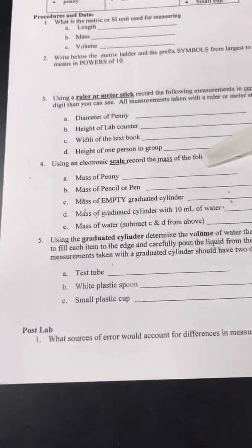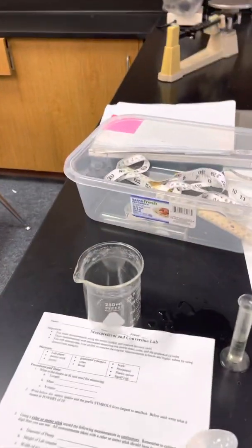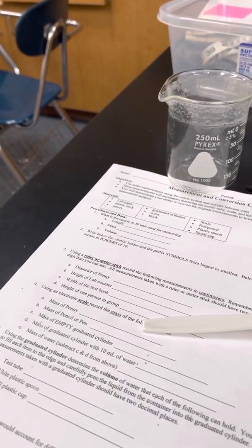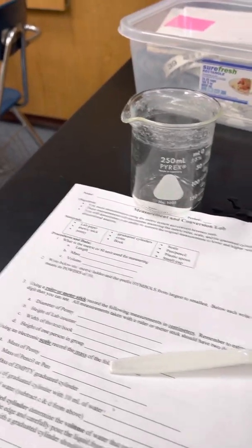Okay, and then finally, the last data is a small plastic cup. The small plastic cup is over here. Fill that small plastic cup all the way to the top and see how much it holds. A little bit more.